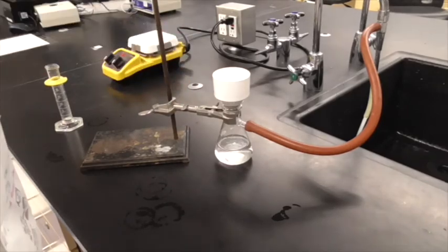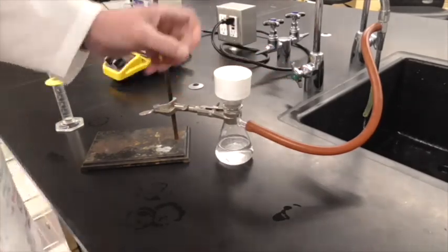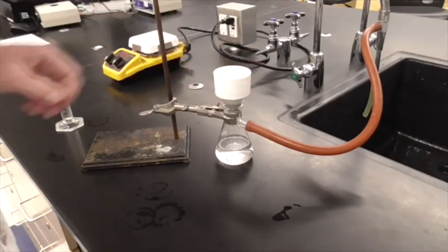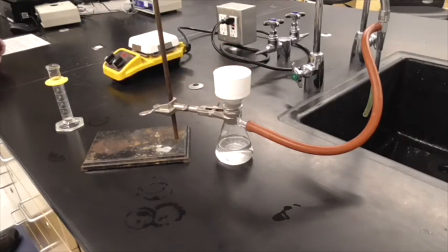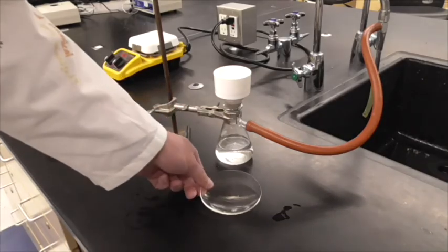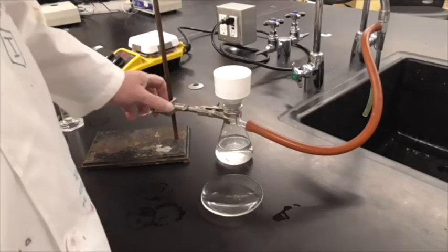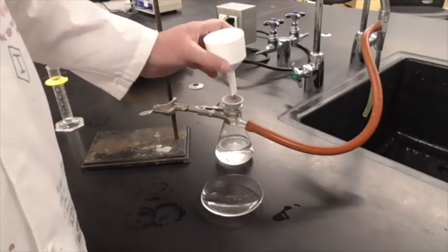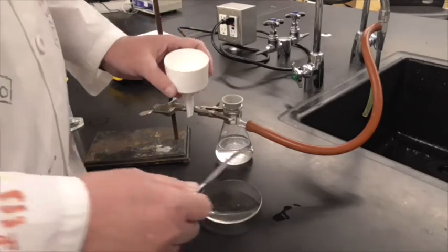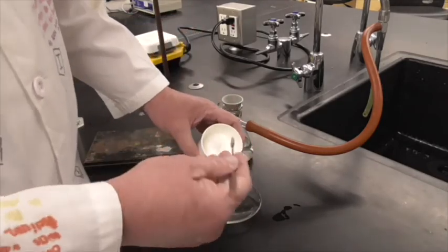Alright, that looks pretty good. So I'm going to turn off the vacuum. You can see the vacuum released a little bit there. And I'm going to go grab my watch glass. So we've got our watch glass here. And I'm going to move the filter and the aspirin to the watch glass. Now I weighed the watch glass because I think a lot of that aspirin is just going to fall onto the watch glass as I try to remove the filter.